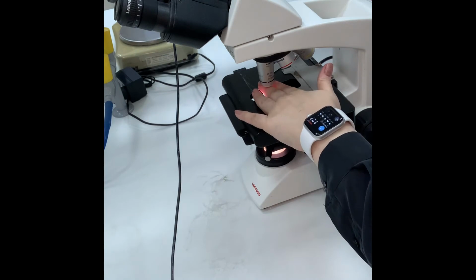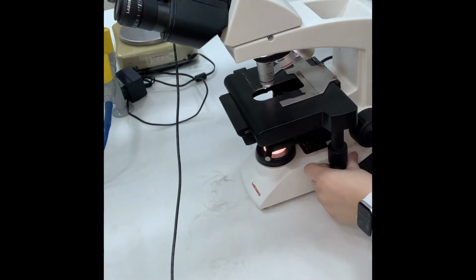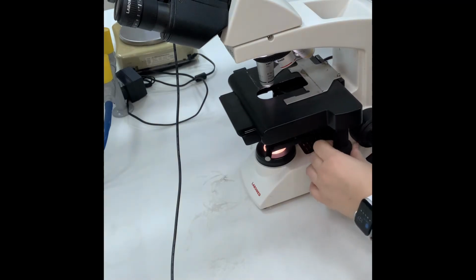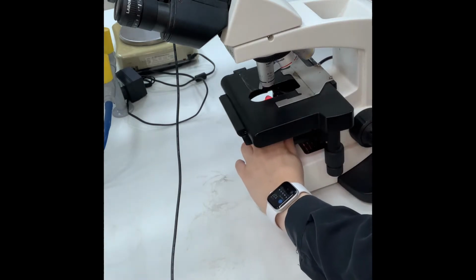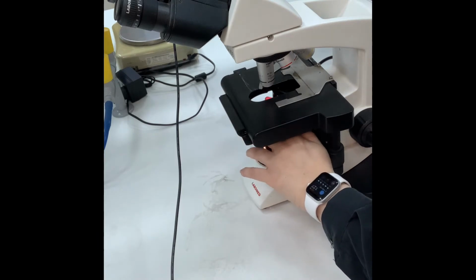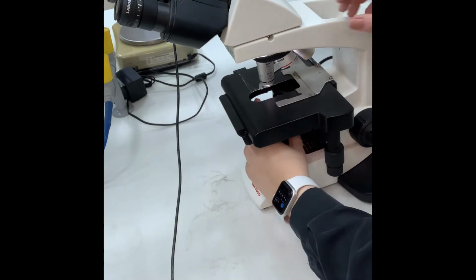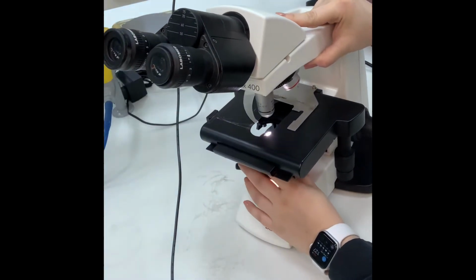The stage carries the slide. This is the mechanical knob. A and B are both called mechanical knobs, used to move the stage. Under the stage, right away, this is a lens. It's a condenser lens. It condenses the light. Can you see it? This one.